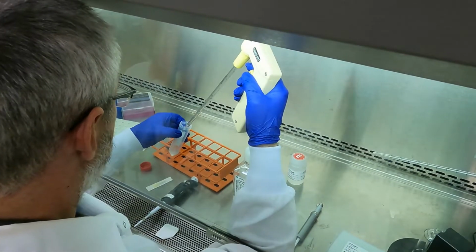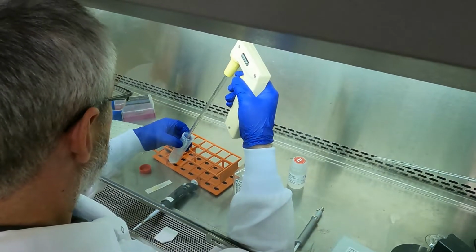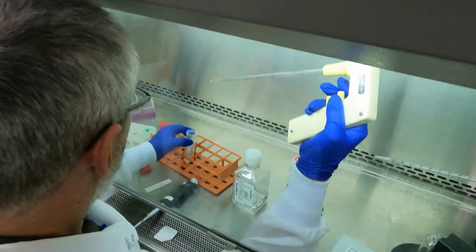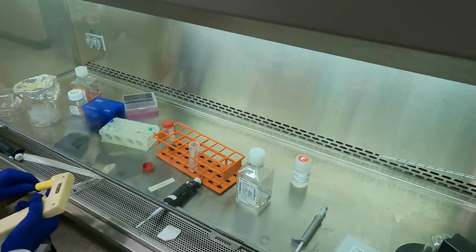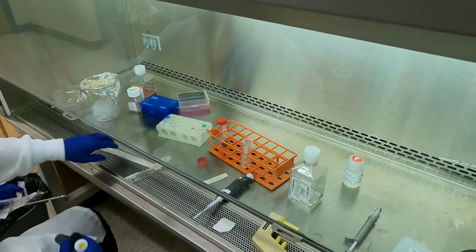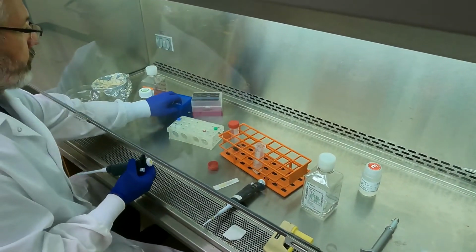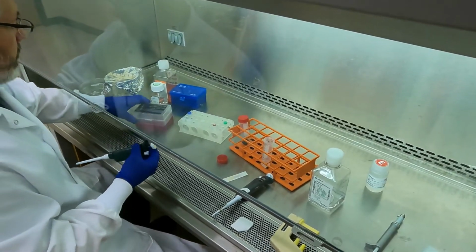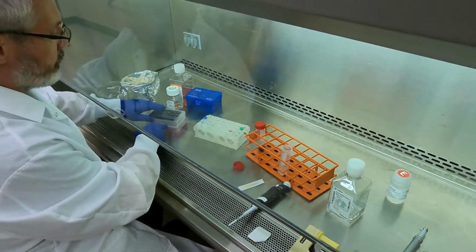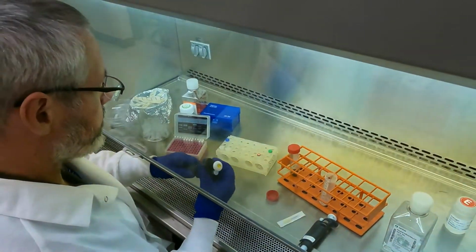Final wash into PBS. It's really nice. Okay. So I want a final 100 microliters at 5 times 10 to the 6. So I'm going to need 200 microliters of these cells. I'm going to put them in here and I'll quickly spin them, very gently, but quickly. And then take them up in 100 of buffer R. And they're ready for the electroporation. So let's get 200 of these.